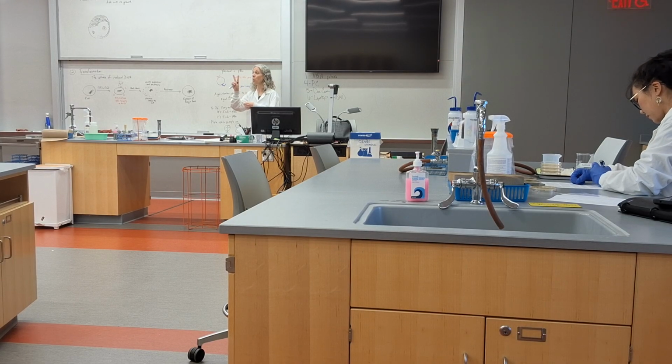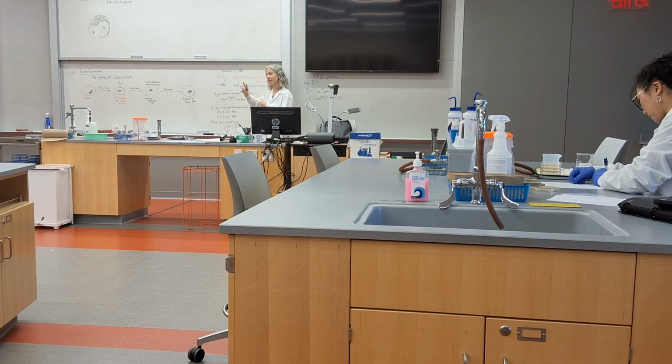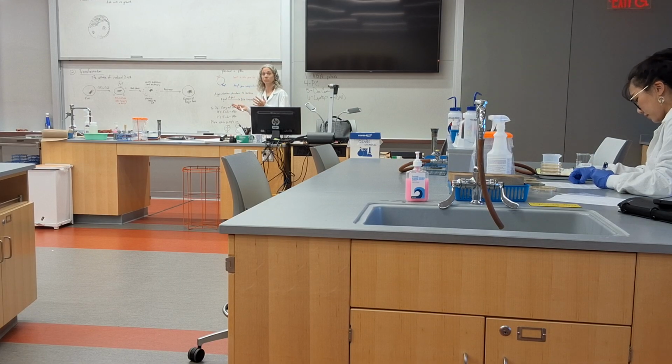So now we have two ways of checking whether transformation occurred. The first one is that they can grow in the presence of ampicillin because of this gene. The second one is that they're blue because of this gene producing beta-galactosidase.